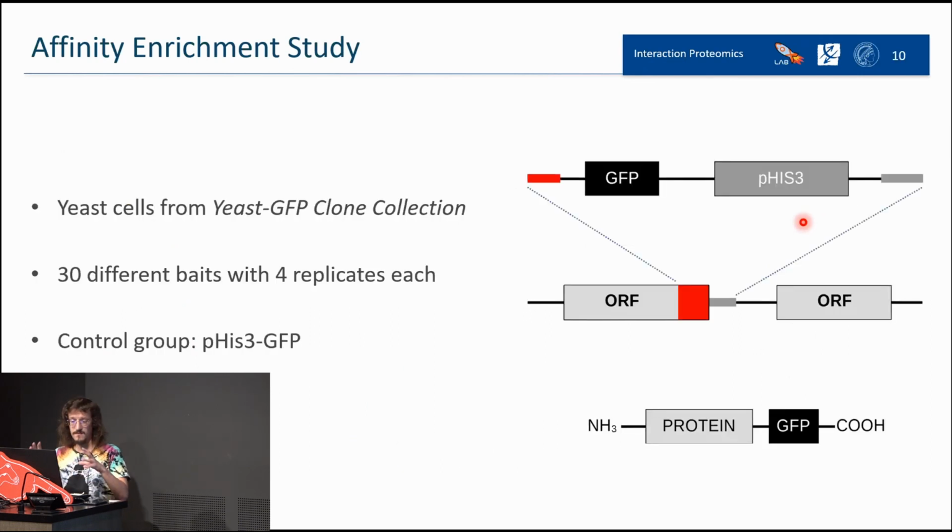Right now I'm showing you a brief introduction about interactomics, but on the USB stick that you have, you will find the data coming from this work. Also in the practical part, you will repeat, generally speaking, what was done in this paper. And you will have two different Perseus sessions if you want to repeat everything: one that starts from the pre-processing already done, and one that is the complete one. So if you want to check every single step, you will have the complete Perseus session. It will be everything that I will show you later.